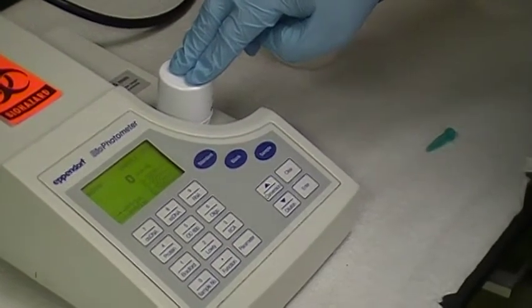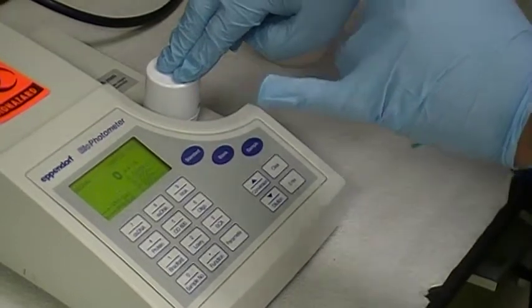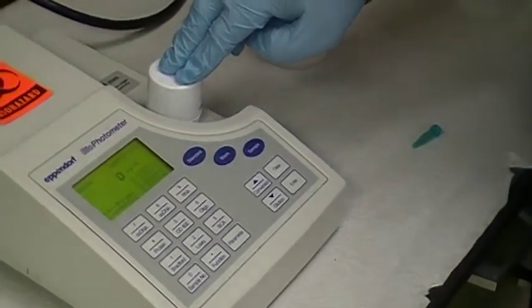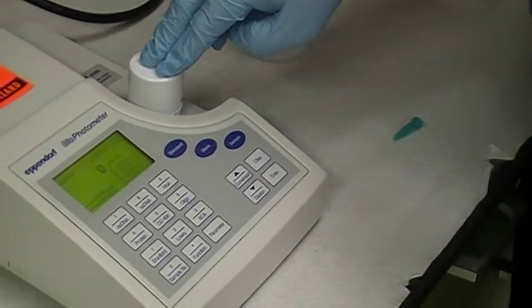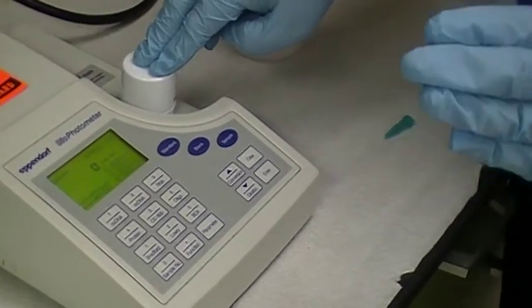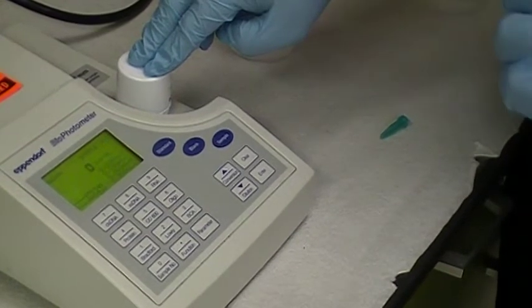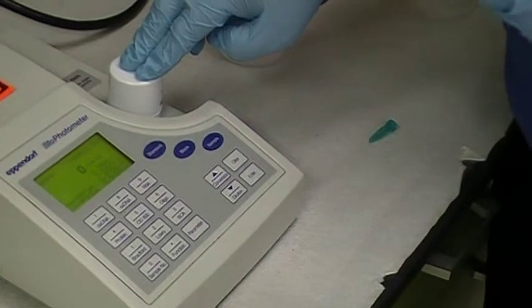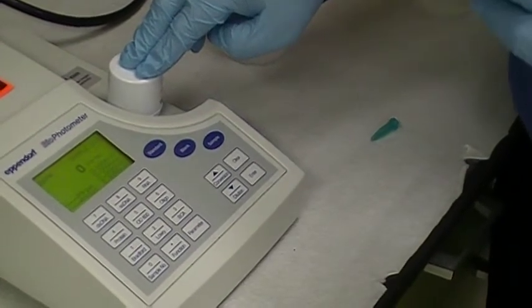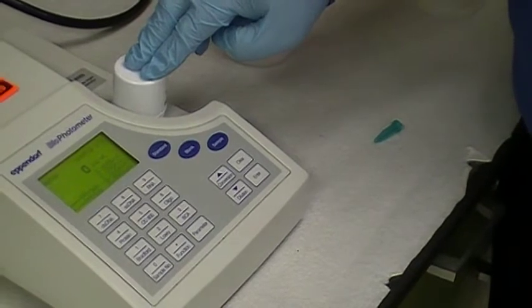Now, it should give you a value. Now, don't worry about the calculation. This machine is not as smart as you are. The calculation does not take into consideration how to calculate the concentration. Now, there is a formula that says one absorbance of double-stranded DNA is equal to 50 micrograms per mil of double-stranded DNA. That is the ratio that you use to calculate.